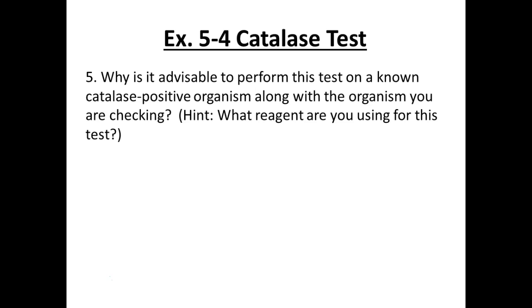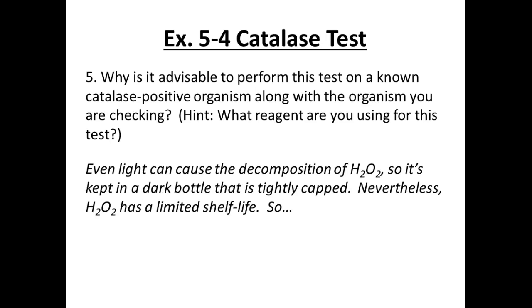So a lot of people used to use this as an antiseptic, put it on your skin. There's an old wives' tale that if it doesn't bubble, it's not infected. That's wrong, right? It should always bubble, because guess what? You're catalase positive. You're an aerobe, right? Do you produce hydrogen peroxide? Yeah, you do. So it should always bubble. If it doesn't bubble, it means you just poured water on yourself.